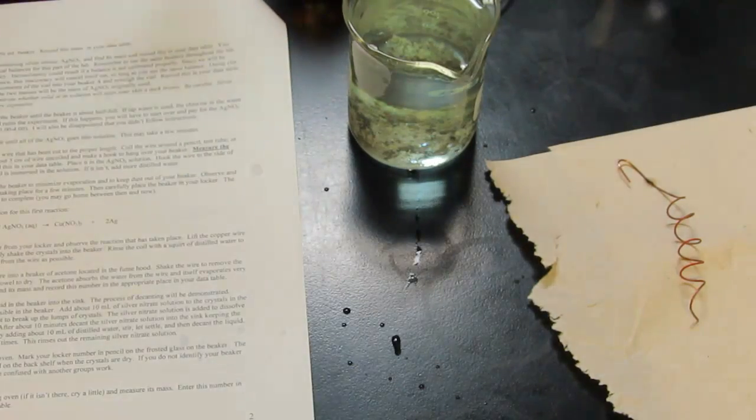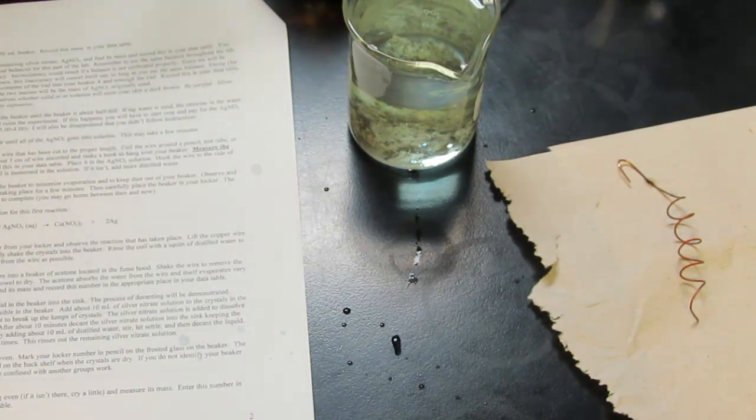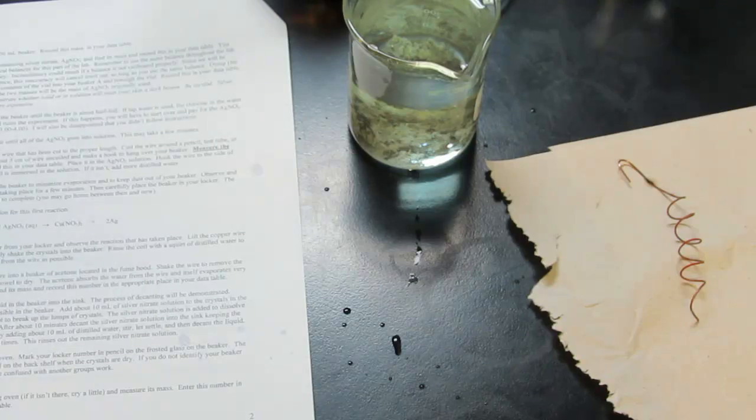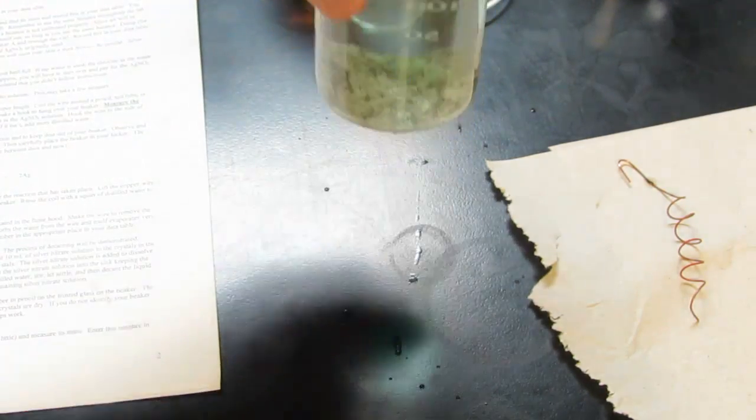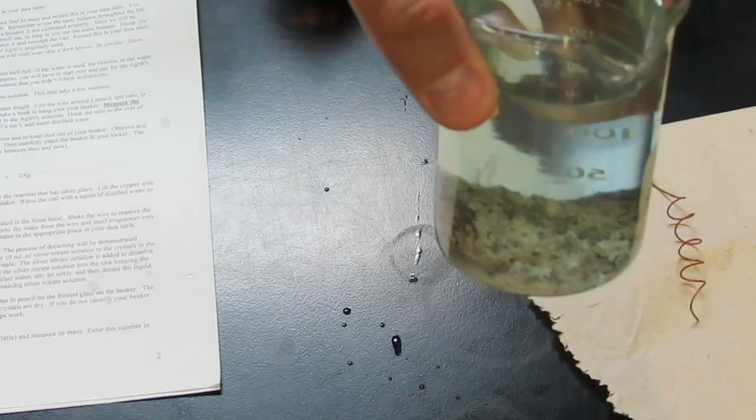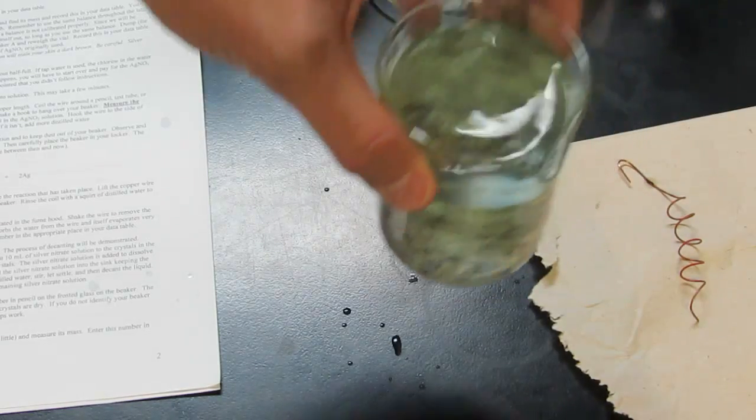We'll get our balance set up because we're going to be needing that in a bit to find the mass of our copper wire. That way we can determine how much copper reacted. Now you'll notice that we have a bunch of silver on the bottom of that beaker and we need to decant the water.